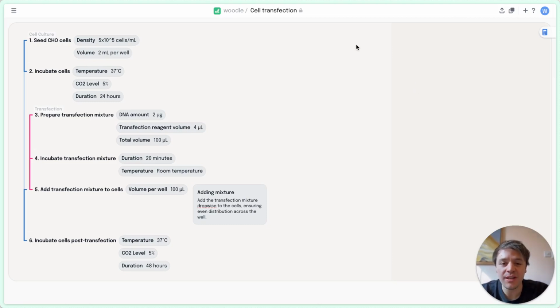To help you create complete and consistent protocols and experiments, we've built an AI Copilot into our experiment builder that helps you speed up in a few different ways. And so today I'm going to show you how it works and also a few different use cases.